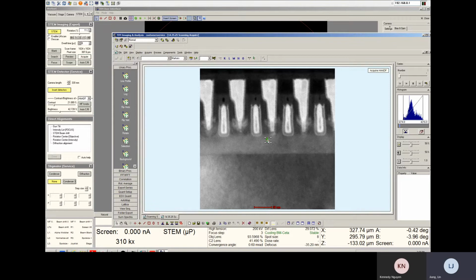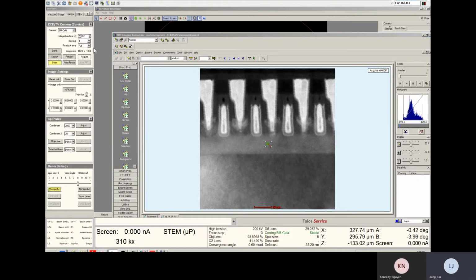Just like how you do nanobeam diffraction, you set up condition, you set up your theta, insert camera, you want to go for 40 frame. Let's not go that, that's too much.